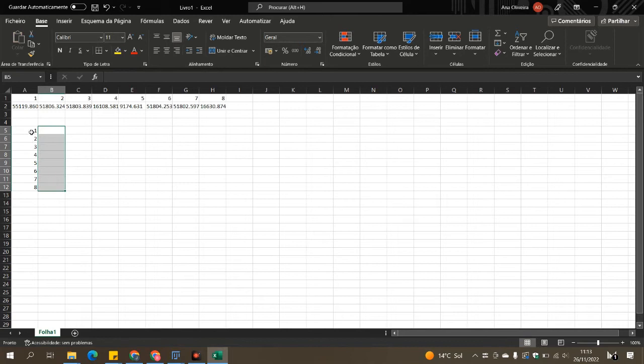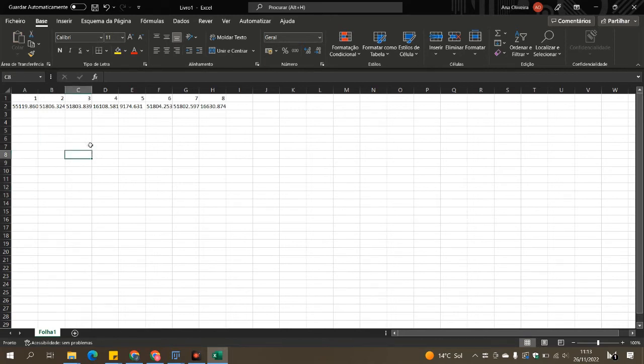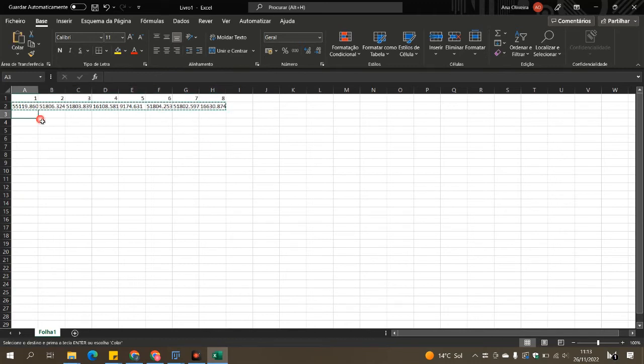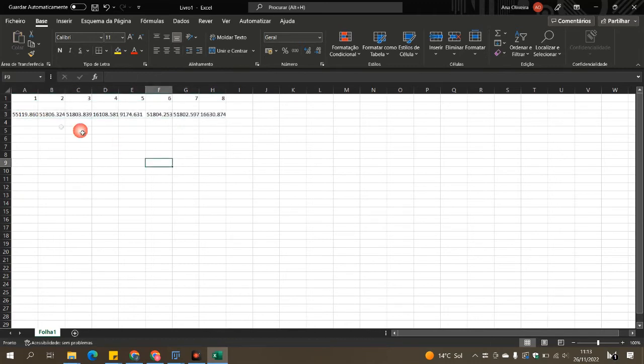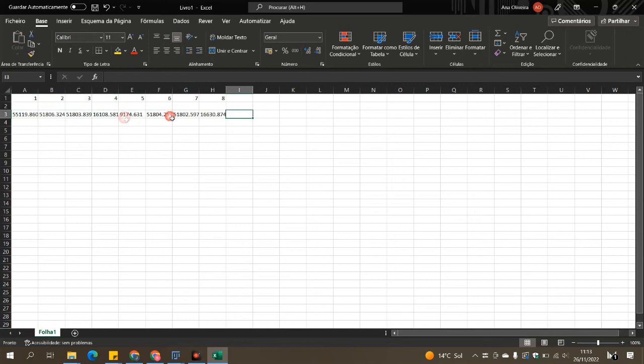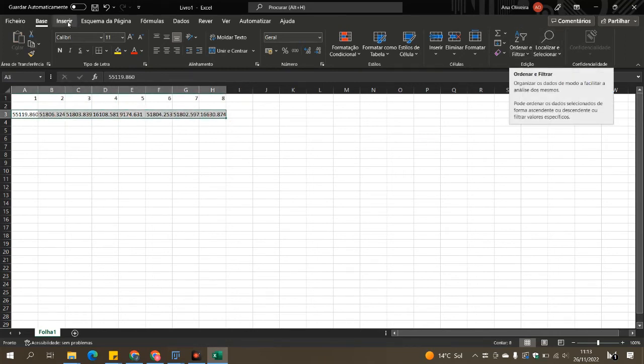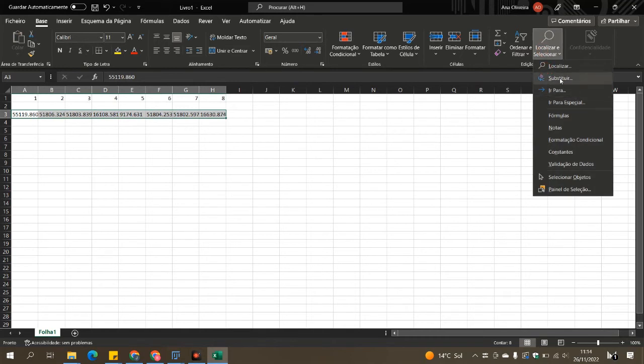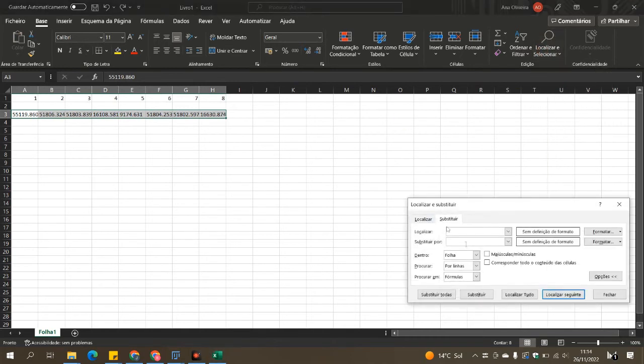For the purpose of this video, we will pretend that these values are for the loading control and we will normalize all the values to the control. I will make some values for our target protein. For this example, we will also pretend that the first lane is our control, like in a cell culture experiment, and the others are treatments.